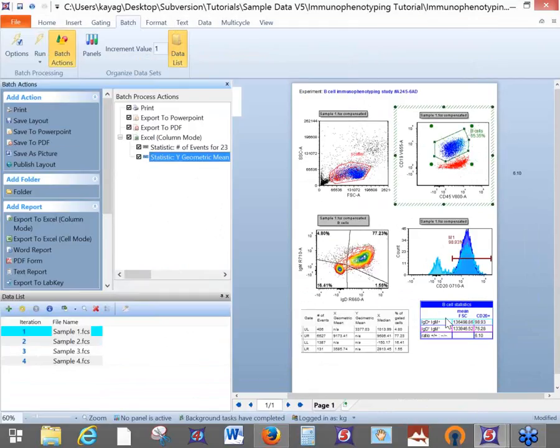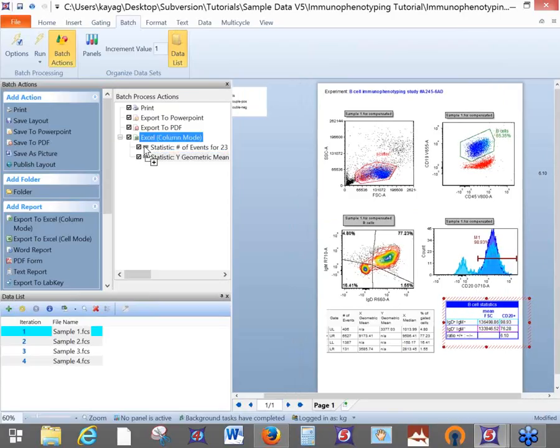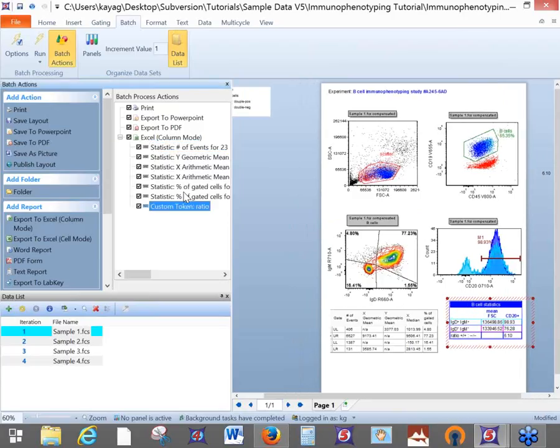This nice custom table that we built together, we can drag all of the stats over from it simultaneously by grabbing it from its border. You see my cursor becomes a little four-headed arrow. So you see all 4 of those were dragged over simultaneously.